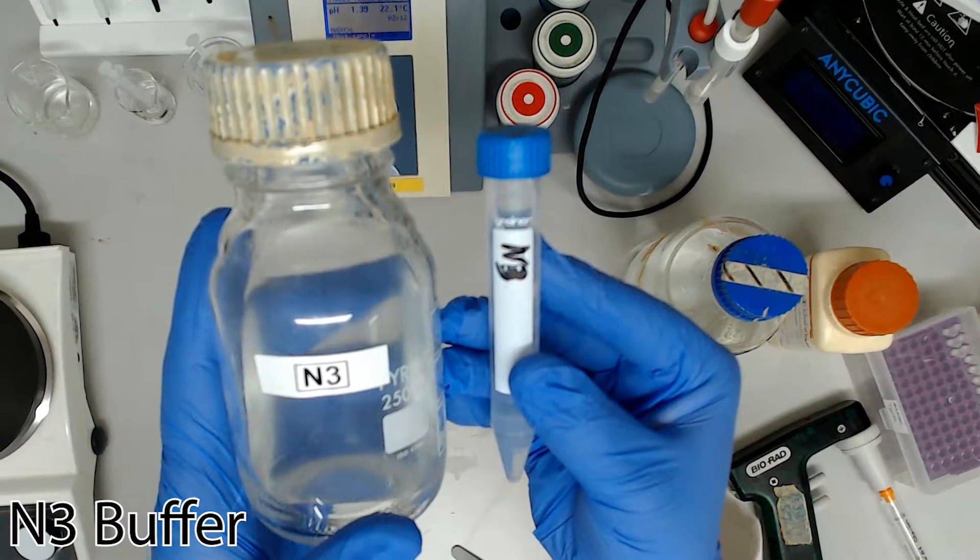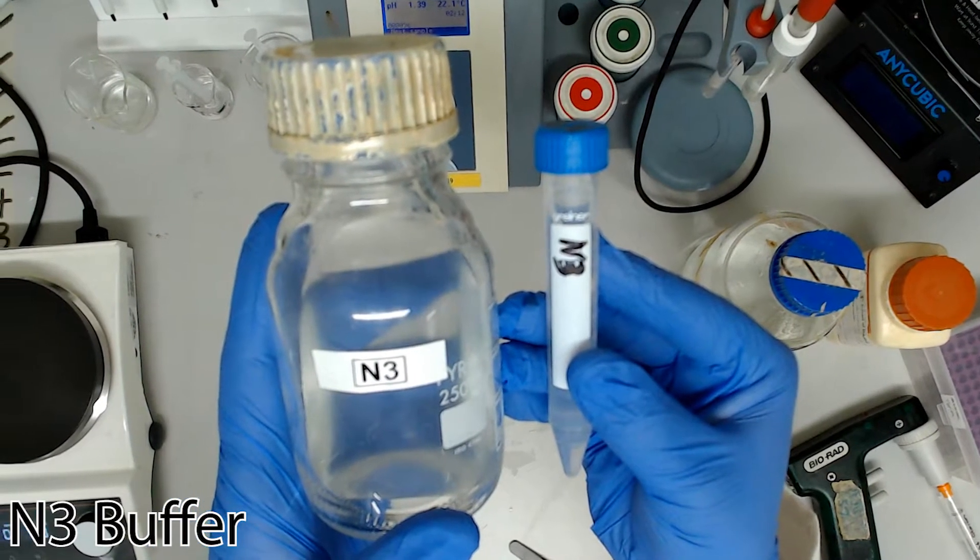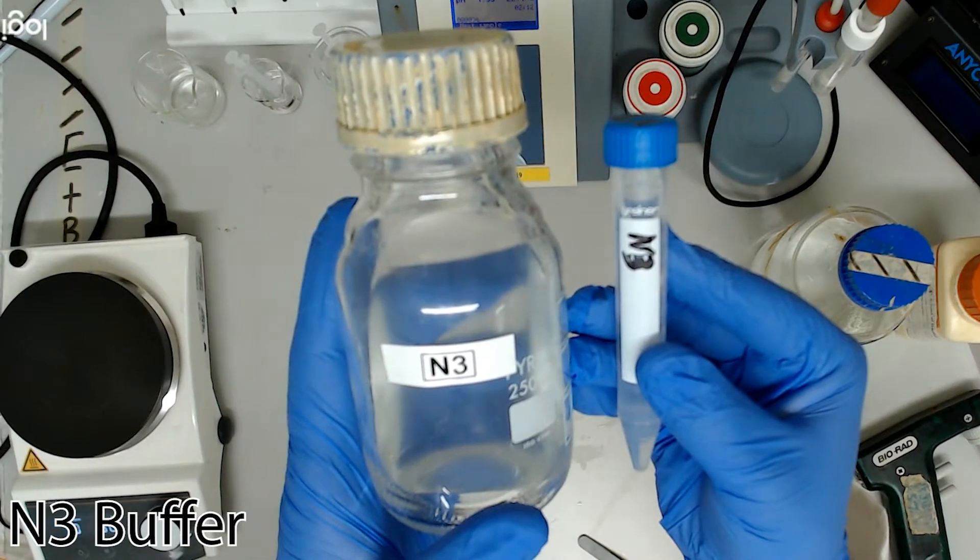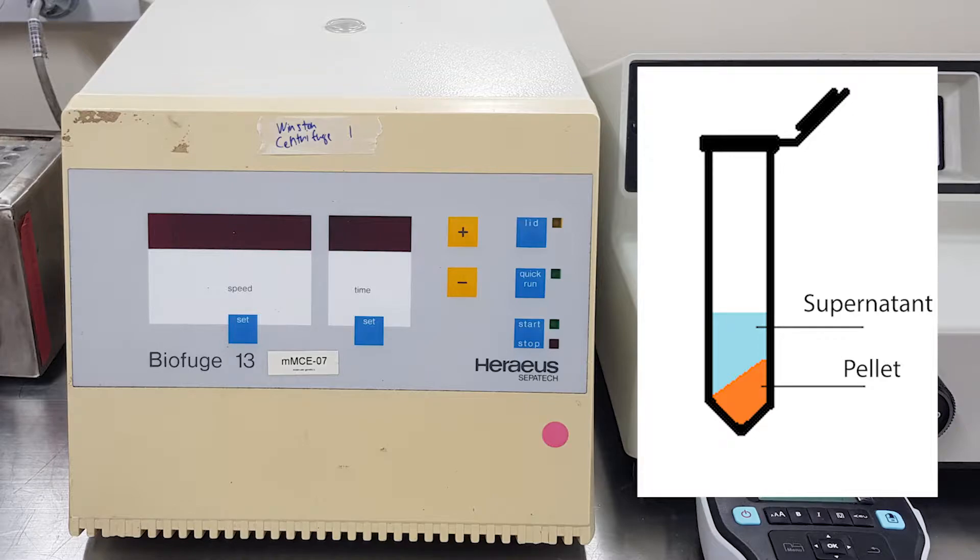The next buffer in the series is aptly named the neutralization buffer as it will precipitate out denatured proteins, chromosomal DNA, cellular debris and SDS, leaving our much smaller plasmid DNA within the solution. This combination of buffers will allow us to use a centrifugation step to quickly separate our plasmid DNA from the majority of the cellular mass.